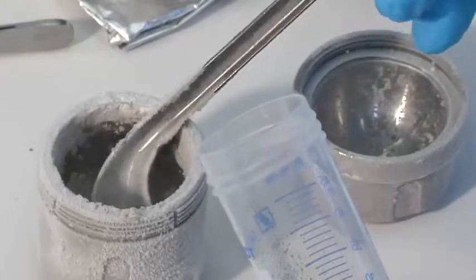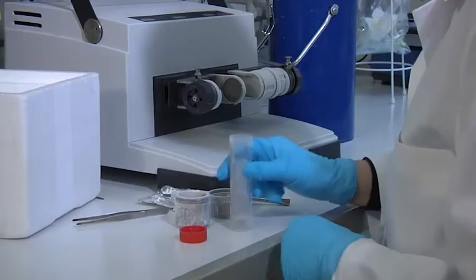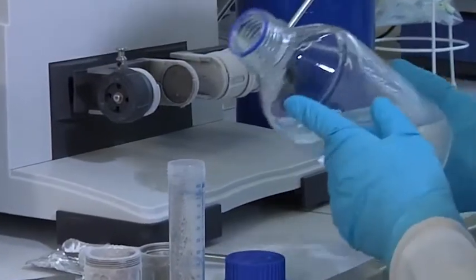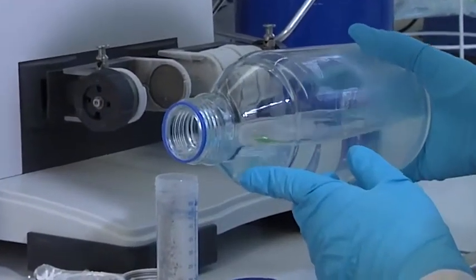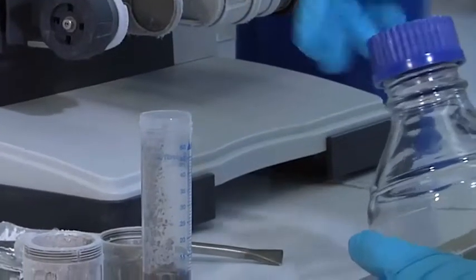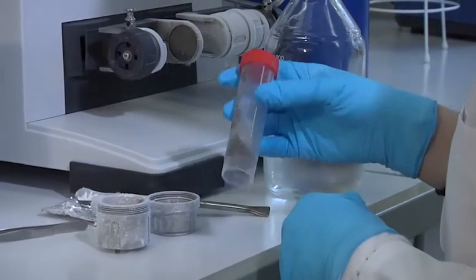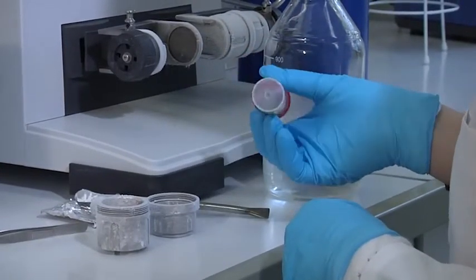For this process, we use the supernatant of the cell centrifugation. For further processing, proteins in the supernatant are precipitated overnight and subsequently centrifuged. The result is a protein pellet which can be found on the bottom of the tube.